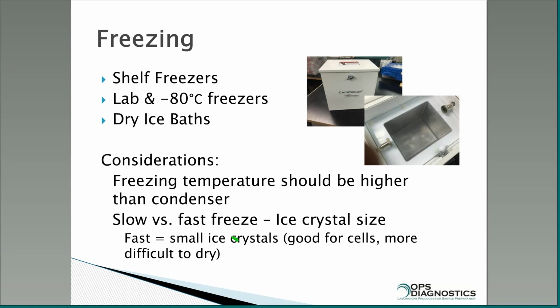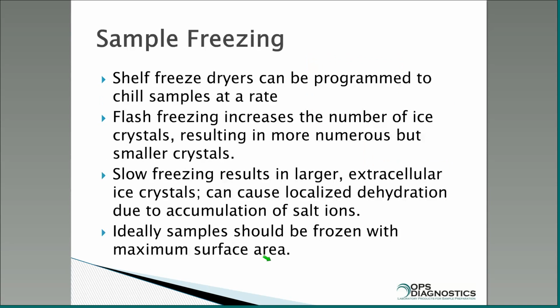So you need a balance between something that's really good for your sample and something that water can get out of easily. And normally when you're dealing with something like a bacteria, the efficiency is normally so high anyway that just freezing at, let's say, minus 20 in a regular freezer will usually work well enough to give you good viability in the long run. So, sample freezing.